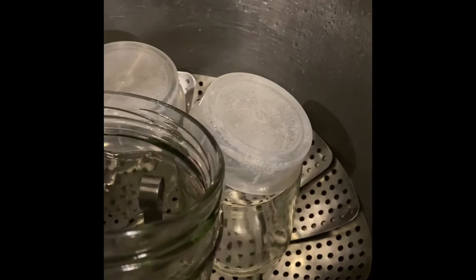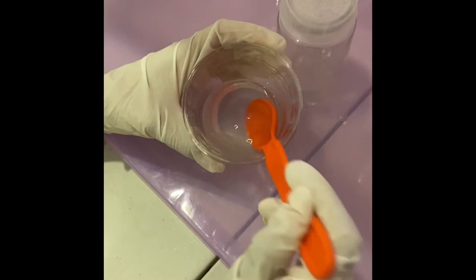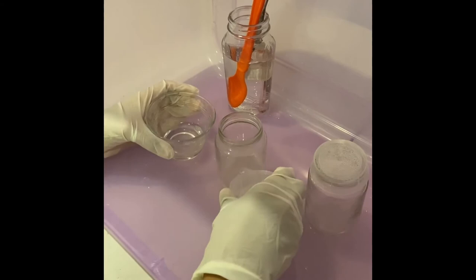The sterilization of the flasks was done using a pressure cooker for 20 minutes. While this happened, I also boiled some water to sterilize it and then use it to prepare the medium. When the flasks were sterile, I started to prepare the medium. First, I put some MS medium in 50 ml of water and mixed it. Then I added the agar and heated it in the microwave until it was completely dissolved in the water. Then I transferred this mixture to the sterile flasks and put the lid on until it solidified.